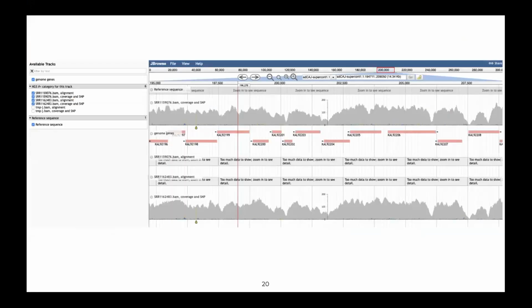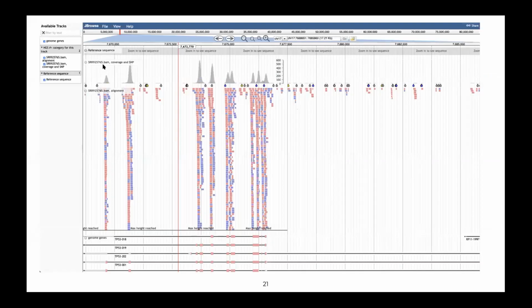So again, just a quick review here. We looked at coverage. We looked at different positions on the GTF file in the genome, and we looked at how we understand what type of information we're looking at and where those important positions are for us to look at. We also saw how it's not a straightforward process for us to just browse through all of the information that we have. That is really where the need for data analysis comes in.